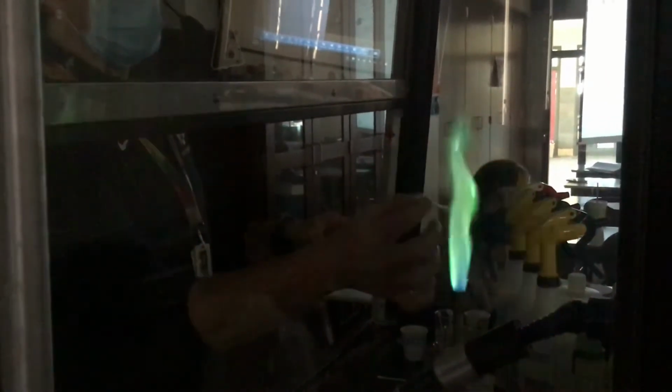All right, next on our list is strontium. Strontium I also have here on a Q-tip. We still have some copper in there, but I think you'll still see the strontium even though the copper color is still going on. Give it just a second. Can you see the strontium color now? What color would you say that is? Red.